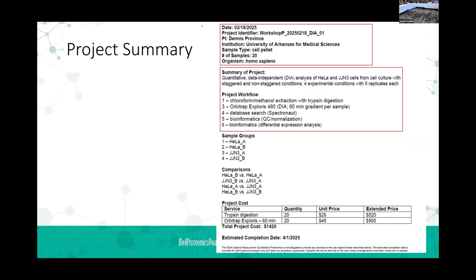And a lot of times when you guys say that you've got this treatment or whatever, you've got this certain condition thing, we're just hoping that you understand your biology. What the important point is that we know that you have some separate groups here, and we know which replicates go into which groups and which groups you're going to compare, right? So all of that other, I'm going to call it biological jargon and stuff, a lot of times can be almost a distraction to us, because what we really want to know is that you have groups A and B and C and D, and you want to compare A and B and C and D, but not A and D or whatever. That would be helpful to us.